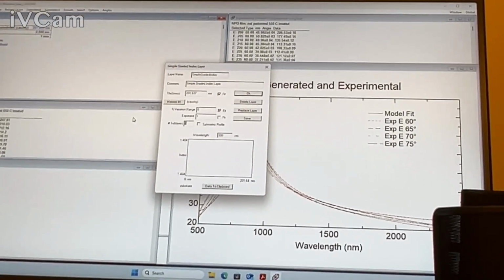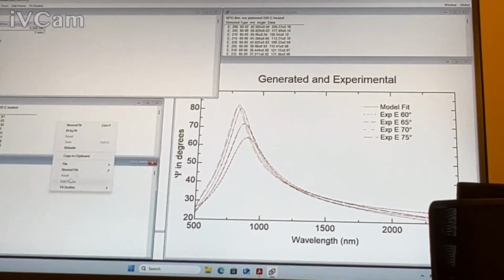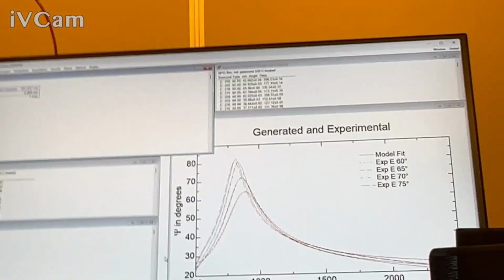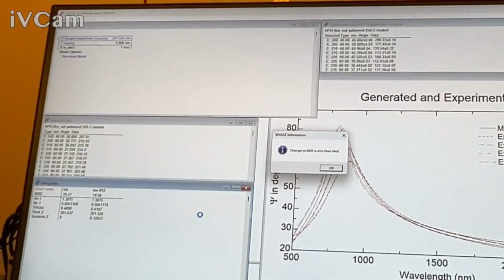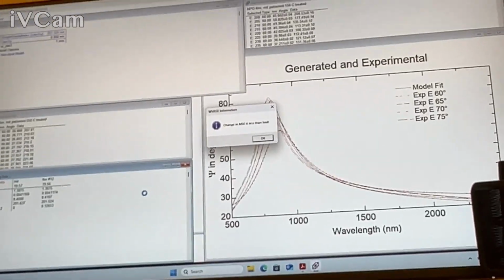So usually I bump how many steps it has, turn off symmetric, and just do a quick variation. Same comment. It took those Cauchy values and it's allowing them to vary. By default, there's no grading, but if I allow some, same comment. You're testing to say, hey, this was already a good fit. If this fit was poor, then I'd be trying these things, and one of those might be this.